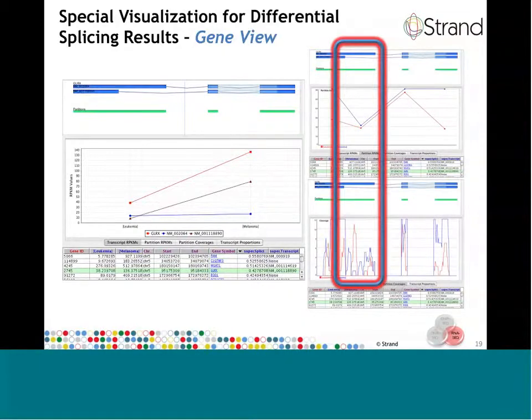And as you can clearly see, the coverage line is much lower for the extended part of the exon in both conditions, providing us with the evidence that the longer version of the transcript does not show any change in expression from one sample to the next. And therefore it followed that the higher expression level we see for gene GLRX is caused by the higher expression of the other shorter transcript.